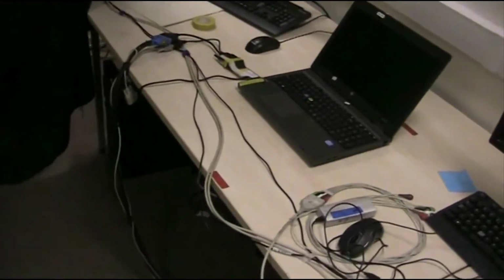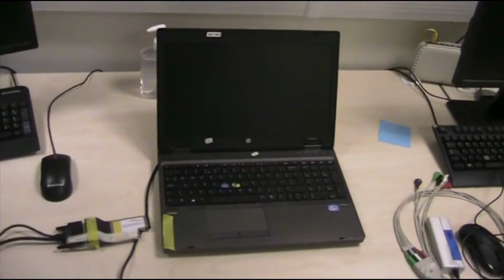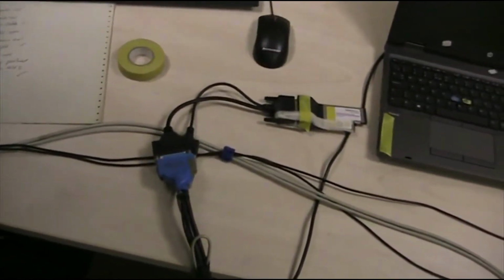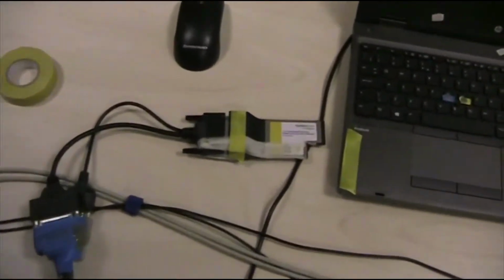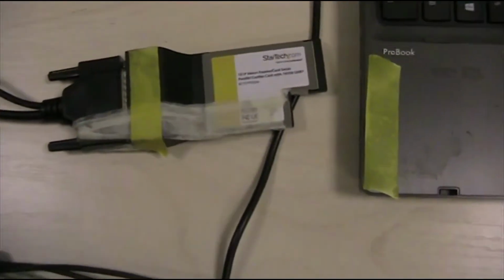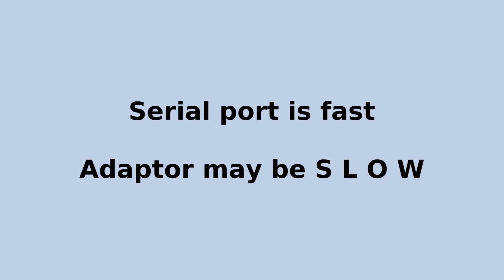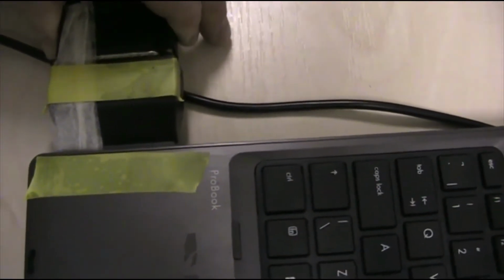Here's the final part of the system, the data collection on a computer. And we're using the serial port, and any computer that can take in a serial connection should be fine. The Patriot communicates via this RS232 or serial cable, which gives a very quick communication and very simple. But for the laptop we've had to use a PCIe adapter card, which slows down the communication to about 100 Hz. And this is only just usable for our experiments, so do be careful about the latency.